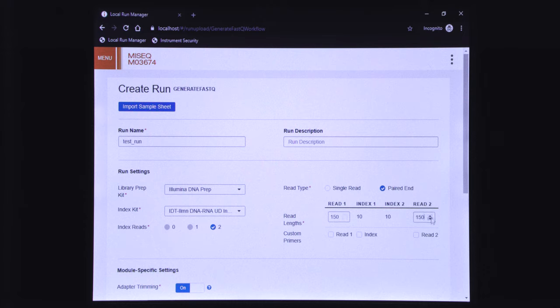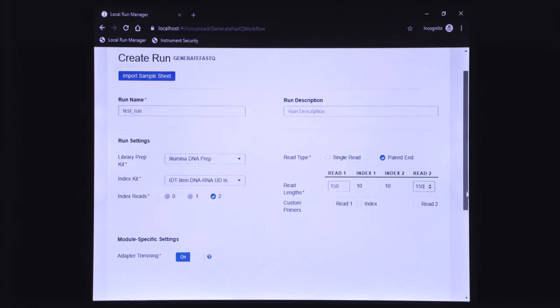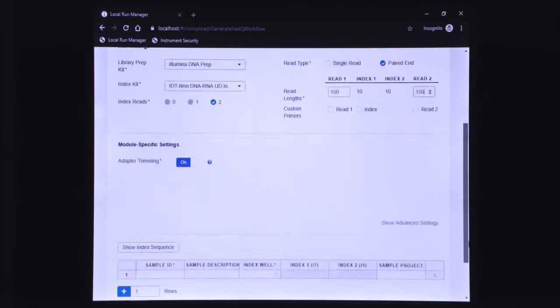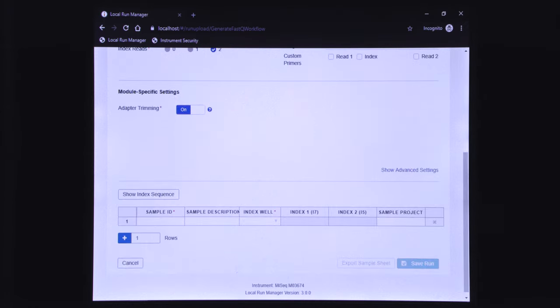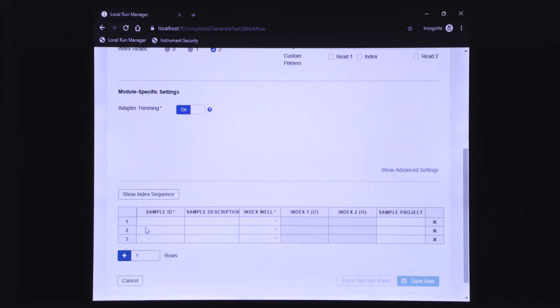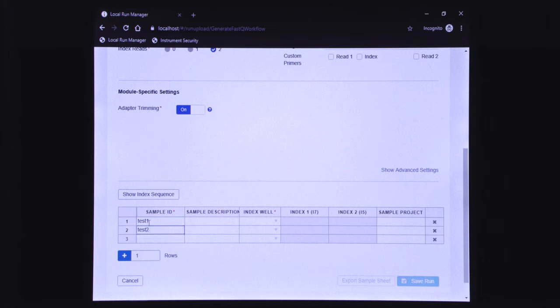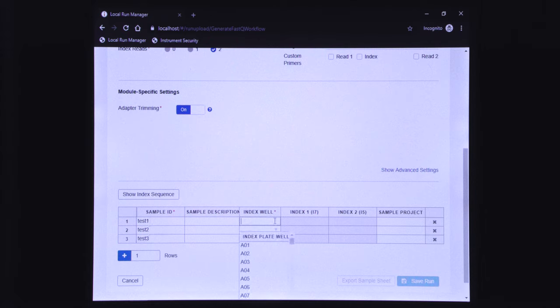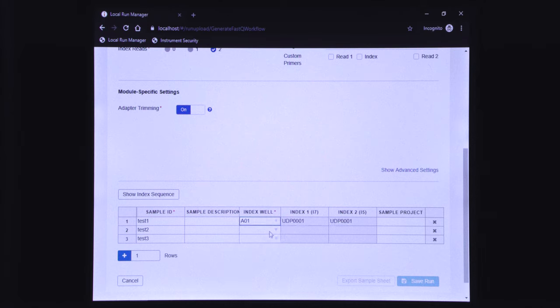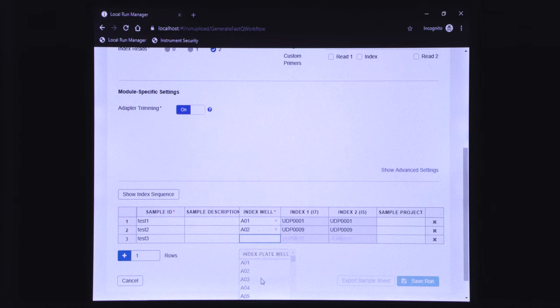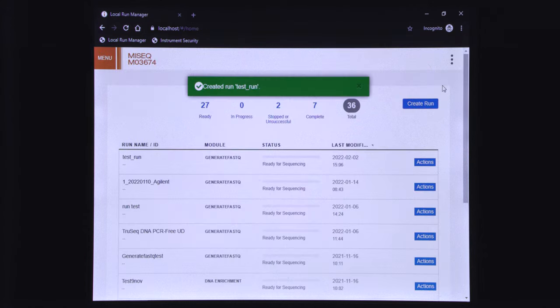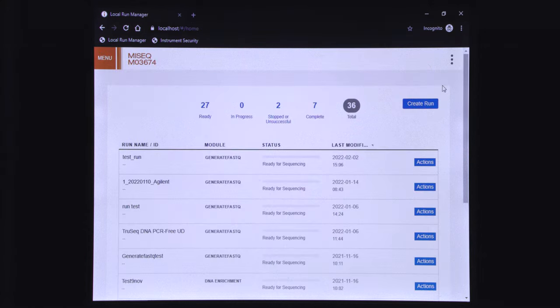Enter the sample IDs and index adapters. Once finished, select save run. Your run is now ready for sequencing.